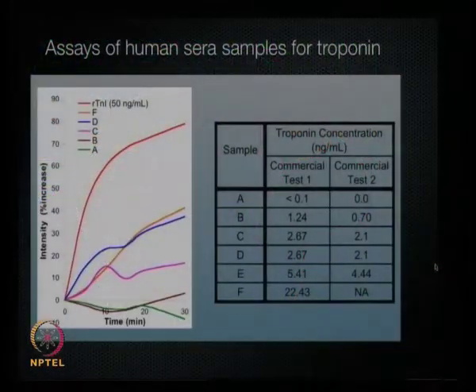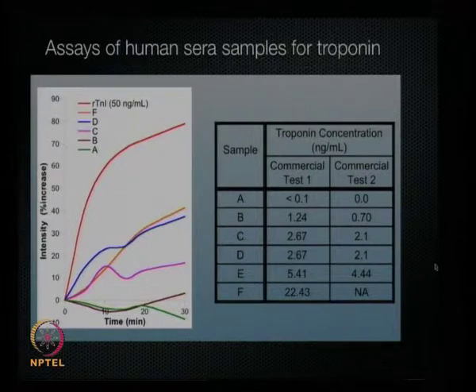So it's actually not just protein that we can look for. These are some data on troponin. This is still a protein antibody assay. The clinically relevant level is around here, above this line, above 2. And you can see this is the signal. This is indicative of the noise of the system. That's why there are wiggles in that signal.